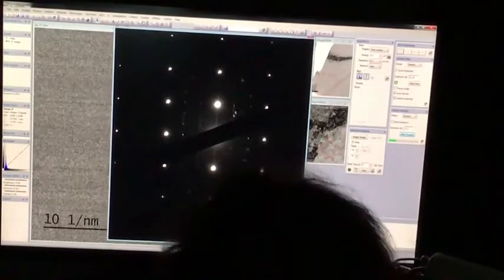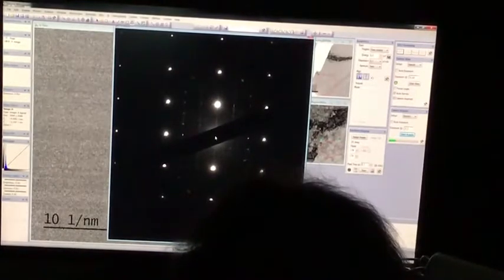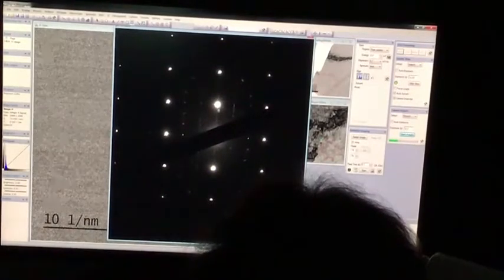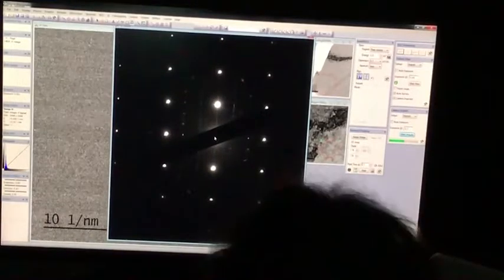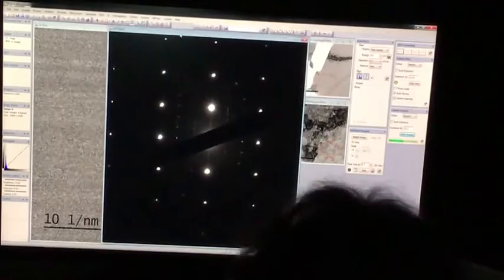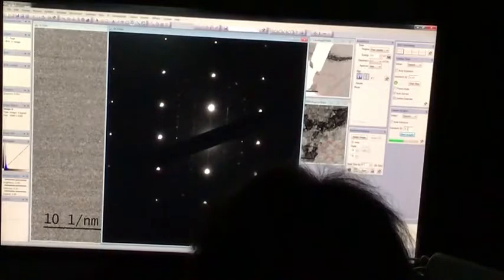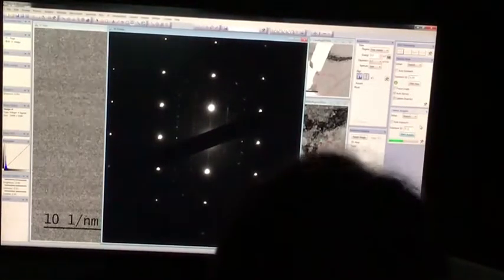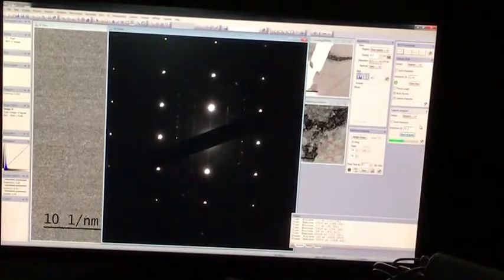And that in there is the central beam. Okay, so you should be able to infer it from all the other points. It's basically the crossing of vectors that you draw between the other points. So I won't mark it because that'll stop you guys from making accurate measurements. I'll see if I can just take a very quick snap at 0.1 of a second without the beam stop. I'll do it very quickly.